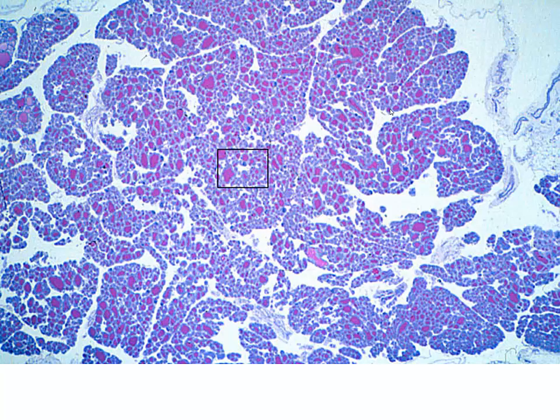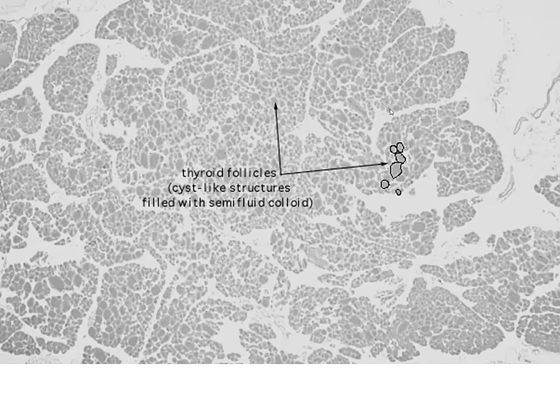Now, as you can tell, we have shifted gears, and even at this low magnification, I'm hopeful that you can appreciate the organization of this tissue, and you can recognize the follicles that are present. Don't really get drawn into looking at the color. The stains might have different colors. Look more at the organization, but hopefully you can see this and very much know that we are looking at thyroid tissue. Again, this is going to be one of the easier ones to really pick out. At low magnification, you sort of have a gut feeling that that's going to be the case.